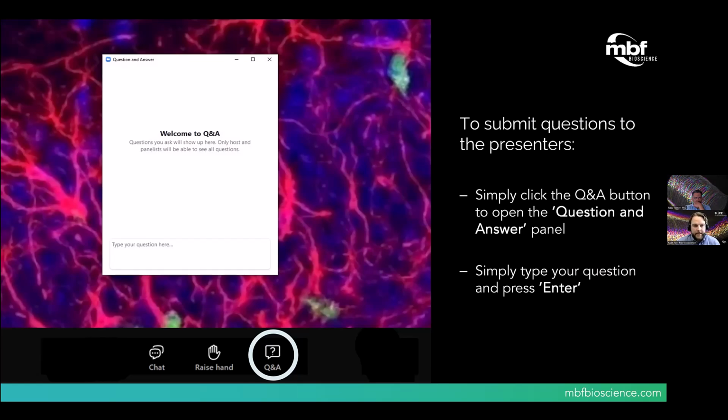If there's another analysis product or software that you really would like to use, we do offer the ability to save whatever image format you need. Typically, we convert to an OME TIFF, which is a more generic image format, and that will allow people to bridge the gap into the analysis software that they need for their experiment.